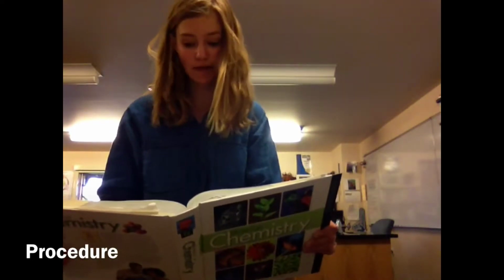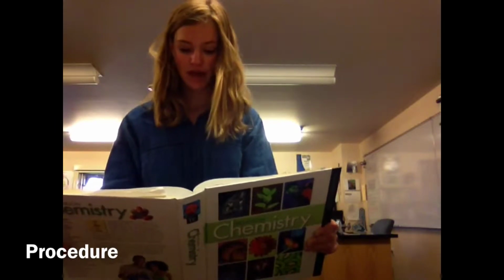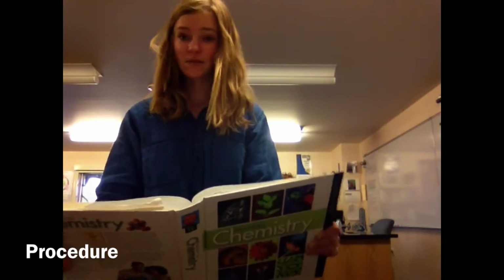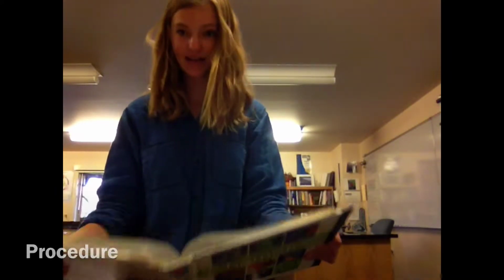On a separate sheet of paper, draw two grids similar to the ones shown in Figure A. Make each square 2 centimeters on each side. Draw black X's on one of the grids. Use the other grid for observations and as a data table. Place the reaction surface over the grid with the black X's and add the chemicals as indicated in Figure A.